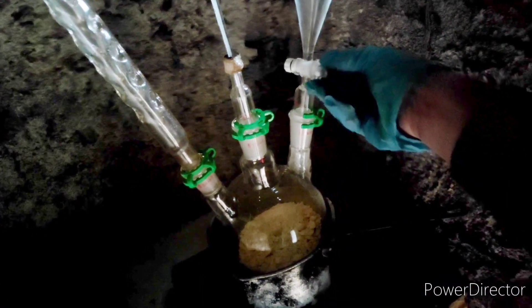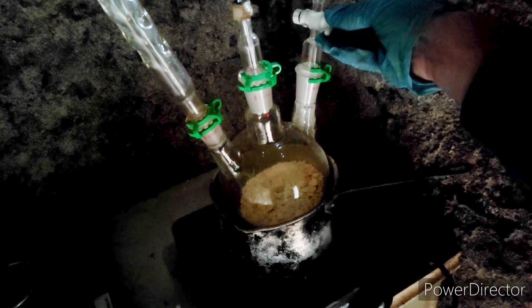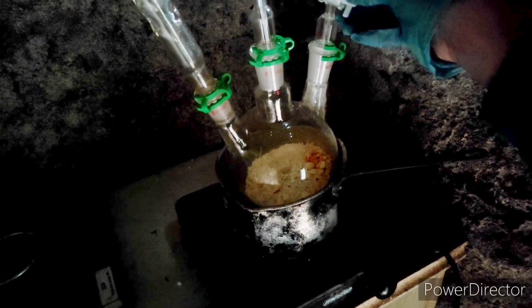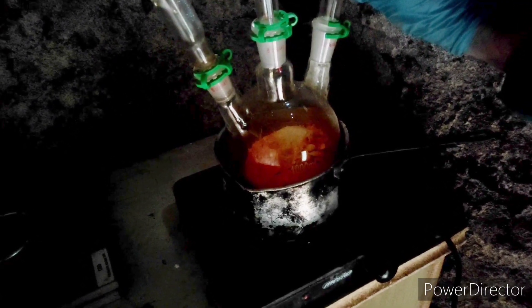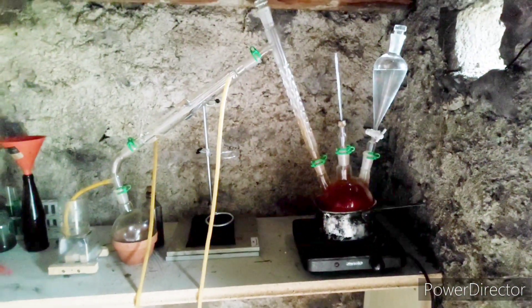The fine BCDMH powder is added to the three-neck flask, and sodium metabisulfite is put in a dilute solution inside the addition funnel. We can immediately observe the red bromine vapors as the reagents come in contact and react — it fills the apparatus quite quickly. You can see the bromine climbing up the Vigreux column.